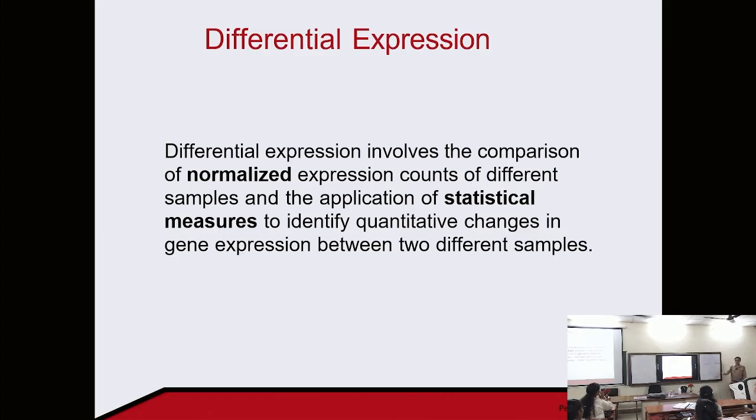For downregulation, it is towards the left, so let's say the value is here. This area is the p value, and you would have set a significance threshold or significance level.